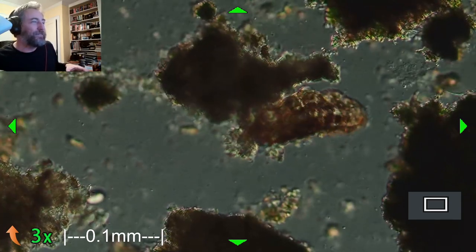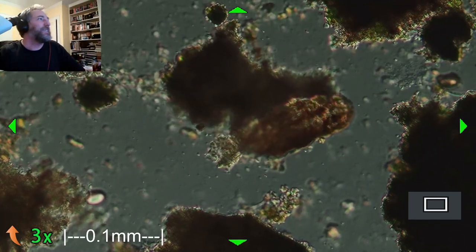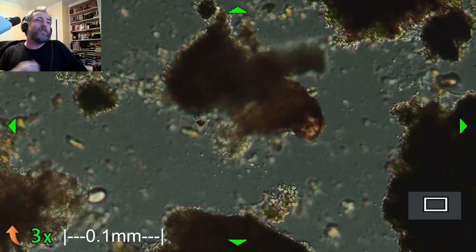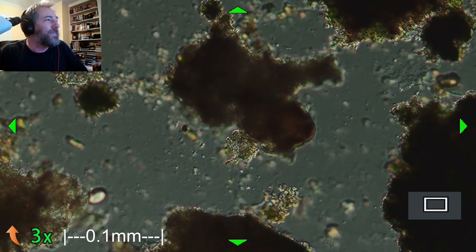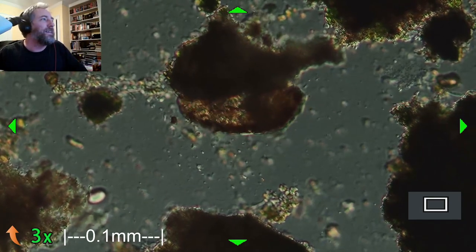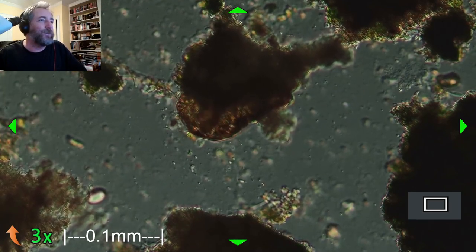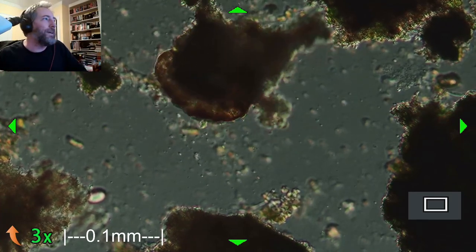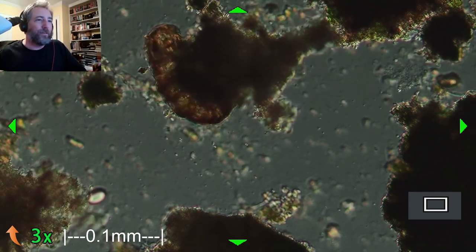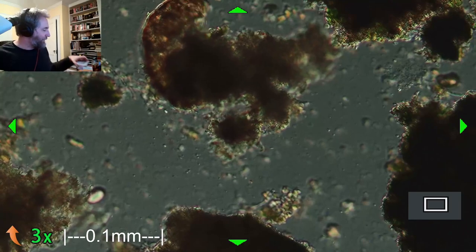Was the stick slimy? No. Well, two of the sticks were from the driveway. They're just little tiny sticks, and so they were still sort of wet. It's been raining here. So the lichen came off very easily, and the ones on the roof were a little bit drier. I was worried that if I just used the ones from the driveway, we might get stuff that had been dormant because it's been raining and wet for a while. I want something that's not been awake for a really long time, so that I could wake it up by adding water to it.